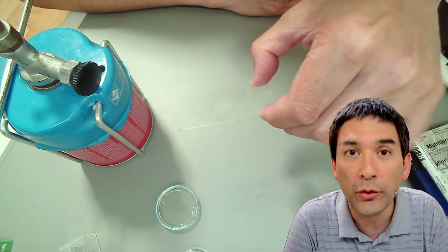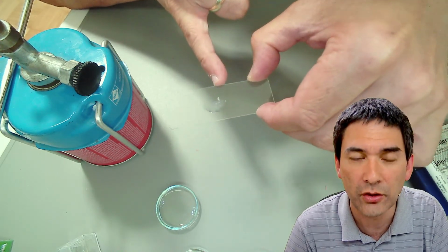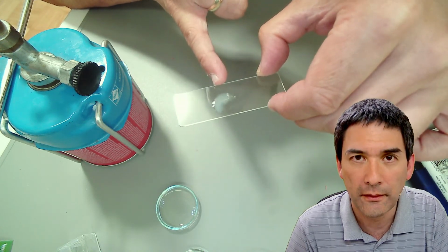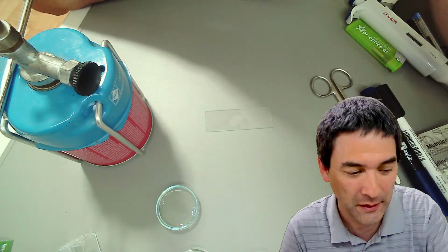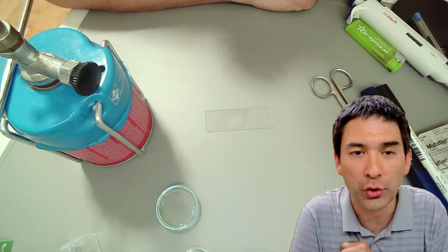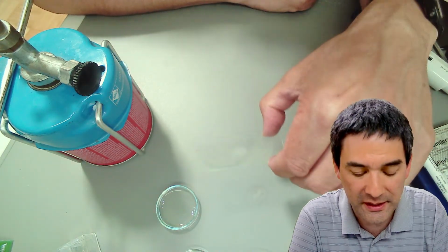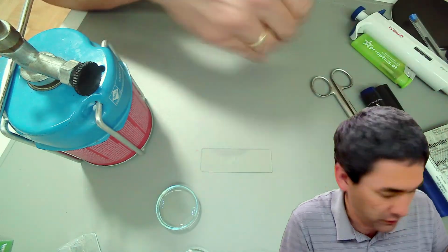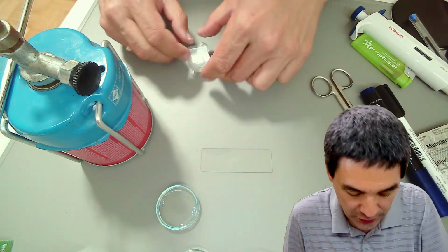Then I'm going to wait until the water has dried. And you actually see that there is something on here, right? Now, I've already got some dried slides. I prepared everything, of course. But because I would like to show you how to heat fix it. What I'm going to do now is just put a cover glass on top here so that we're able to see it directly, just for the fun of it. But actually, I wanted to show you something different later as well.